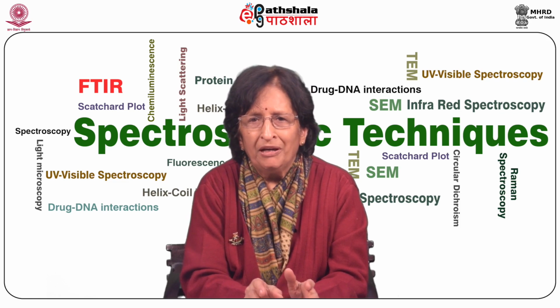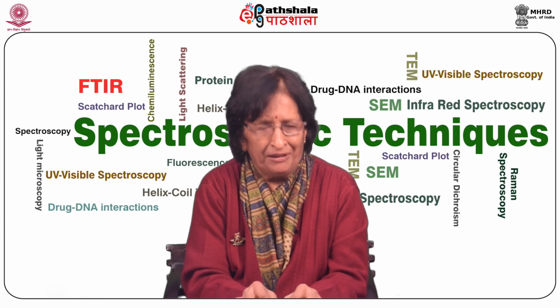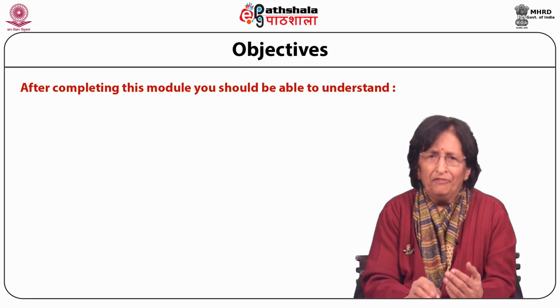Today, we are going to talk about a module on UV visible spectroscopy, Beer-Lambert Law, instrumentation. This belongs to the paper Techniques Used in Molecular Biophysics, Part 2. After completing this module, what you should understand?